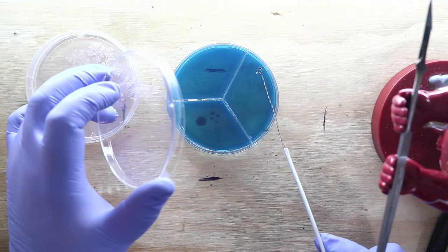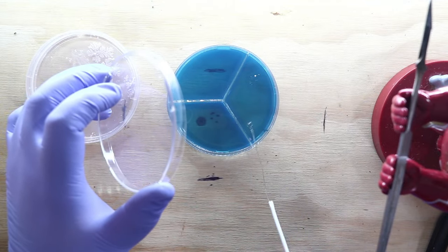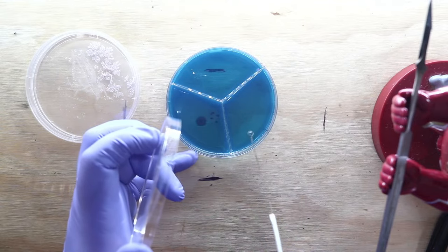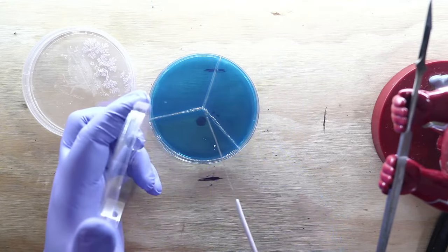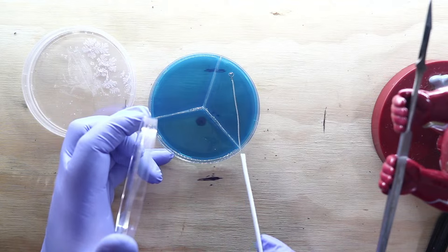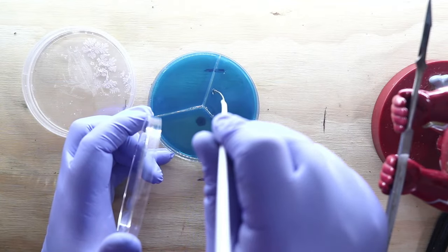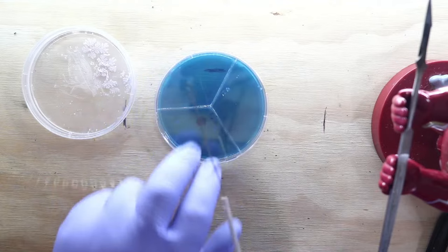So we take it here, and then you start with big, wide scoops, and you go tight there at the bottom. Rotate your dish. Big, wide scoops. Rotate down the bottom. Oh. Did you just catapult them? Hit them a little bit. I'm going to grab this big clump here. And I'm just going to go big, wide. That's a big cluster. I don't want to take that with me. Here we go. All right. We'll clean these spores off.